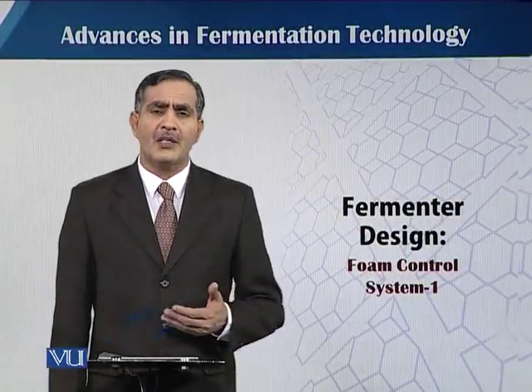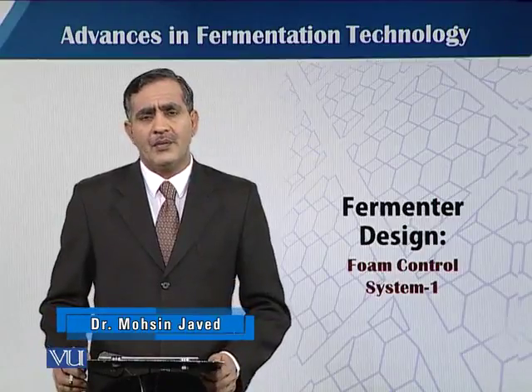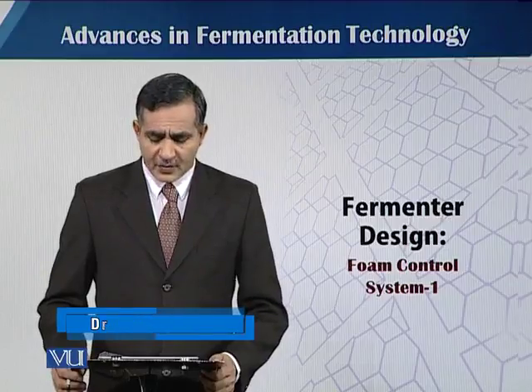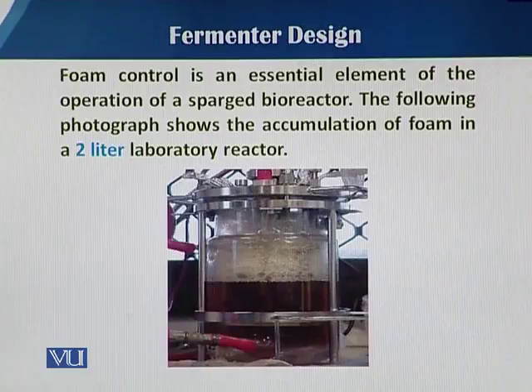In this module, we will talk about the foam control system in the fermentation process, or in a fermenter, while talking about the fermenter design. Foam control is an essential element of the operation of a sparged bioreactor. So when the mixing, agitation system and oxygen delivery system are associated with each other and the process is going on, then what happens?